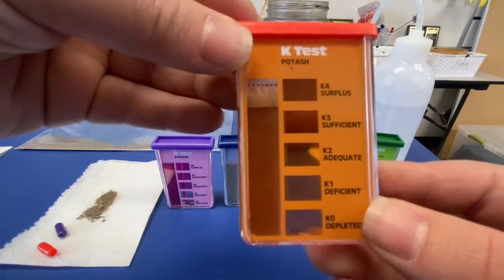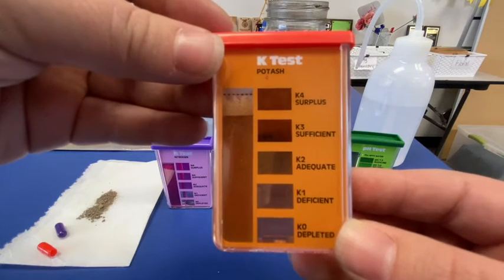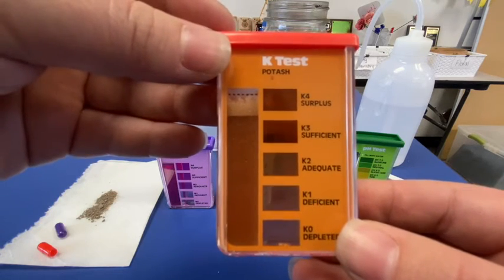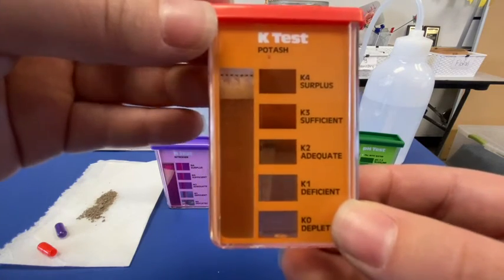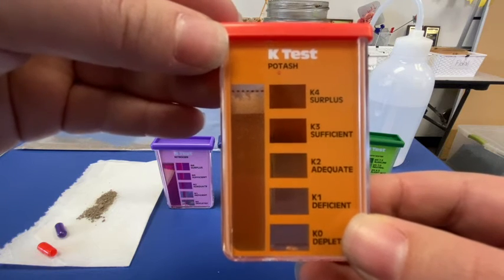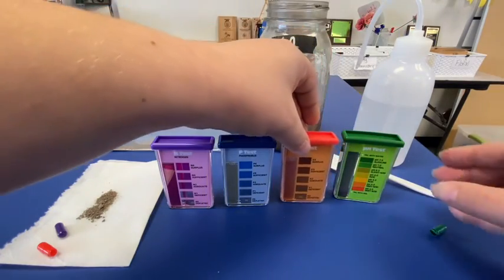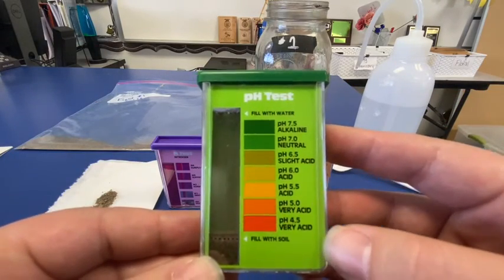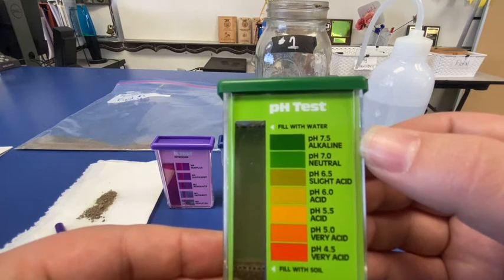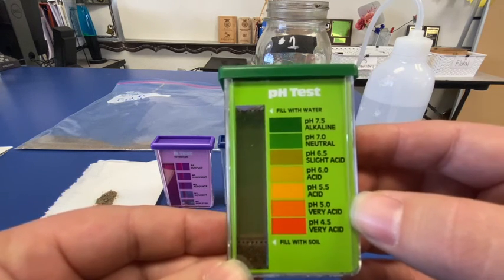The same type of scale applies for potassium: K4 being surplus, K3 — sufficient, K2 — adequate, K1 — deficient, and K0 — depleted. This is all about the potassium levels in this soil sample from field number one. We're capturing that down and highlighting in that orange color. What level is field one for potassium? And we've already done our pH, but I'll show you one more time — going from the bottom of the pH scale. It does give us a good range for what soils really should be.